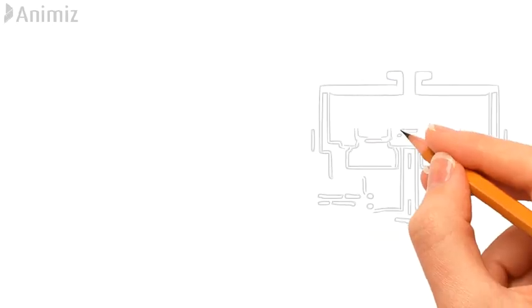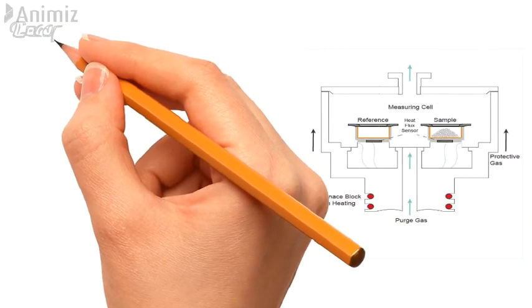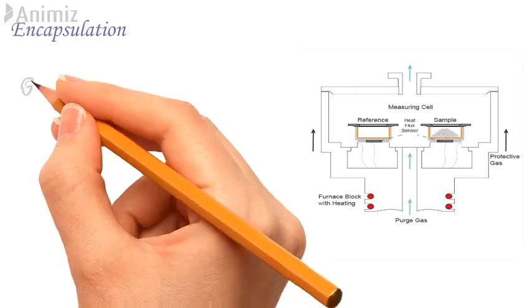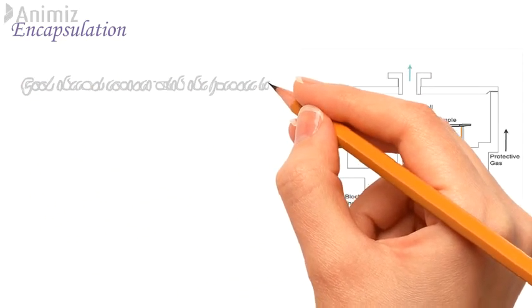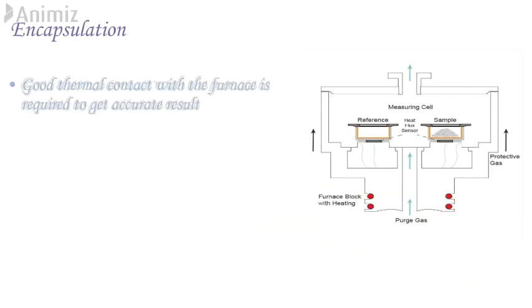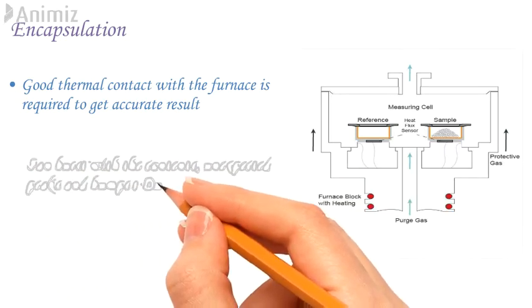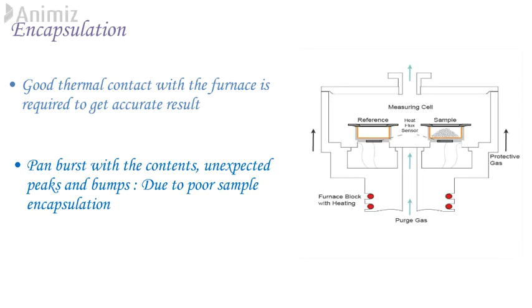Practical issues with DSC. First, Encapsulation. Encapsulation is necessary to prevent contamination of analyzer and to make sure that sample is contained and in good thermal contact with furnace. One of the most annoying sights after a DSC run is to find a pan burst with content all over the furnace or unexpected peaks and bumps in DSC traces with no real cause or problem remaining. Such errors can be due to poor sample encapsulation which is one of the most important areas to be considered in order to obtain good data.